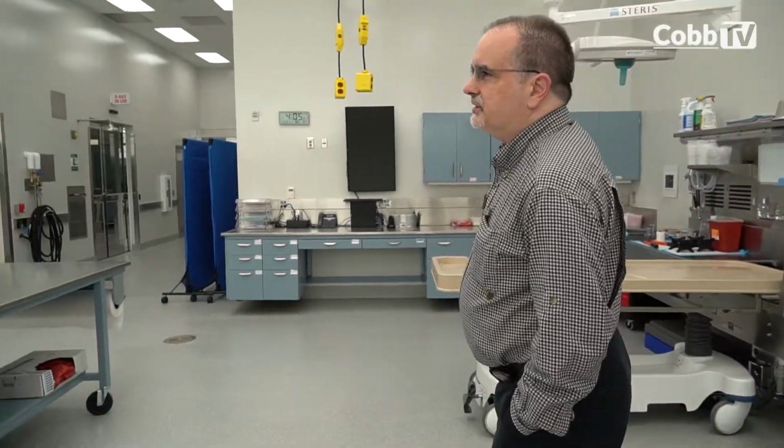When we look at advances in forensic pathology over the past 100 years, probably the largest advancement was the power bone saw. Refrigeration and radiographs have been around for much longer than 100 years. But it's important to realize that as a forensic pathologist, our most important tools are our eyes and our brain and our hands. There is no magical device that you can stick a decedent into that tells you the answer. The answer is discovered by learning, by seeing, and by doing, not by some analysis done by a machine necessarily. But we do have a really spiffy new machine that I'd love to show you.